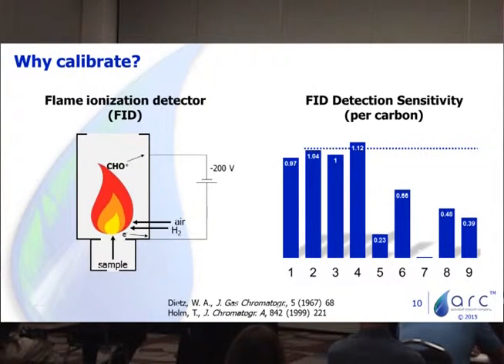Now for straight chain alkanes, the sensitivity, or the number of carbon cations that are formed, is about 1 in every million carbons you form a carbon cation. And that sensitivity is roughly the same from methane all the way up to C30s. There might be differences of about 10 to 20%. But when you add an alcohol group or an acid group, that sensitivity can go down 5-fold or hundreds-fold, where you don't even see that in the FID anymore. And this is because these alcohol groups or these functional groups change the propensity in this flame to form those carbon cations.